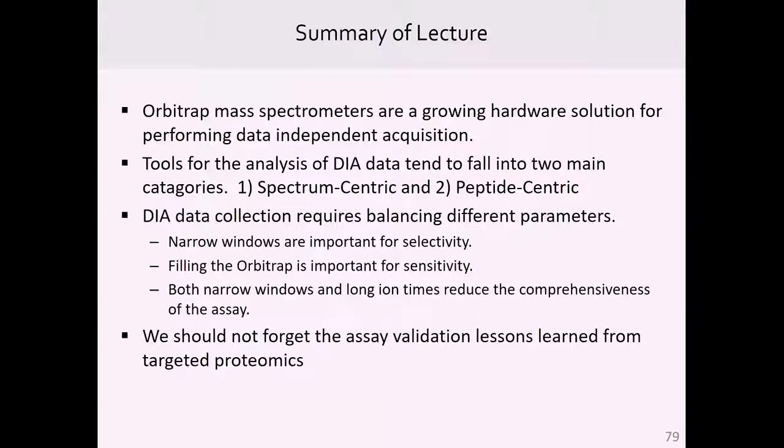You could do all sorts of things, and then you can filter on what you can detect. You could filter based on CVs. Even if you do half your runs at different times, do you still get a less than 20% CV over time? And you get a filtered library, and then you take that to your quantitative tests.